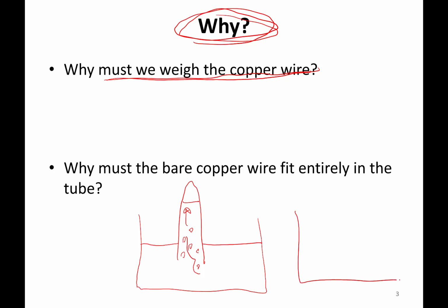If, by the way, some of that wire ends up being outside of the tube, okay, so if we have a copper wire that's hooked up to a crocodile clip over here, here's our crocodile clip, which we're going to use to connect to the copper wire.